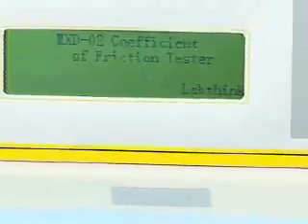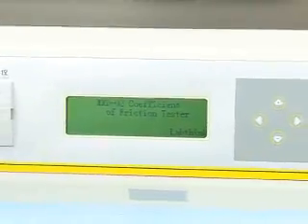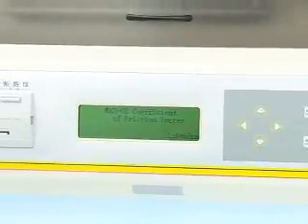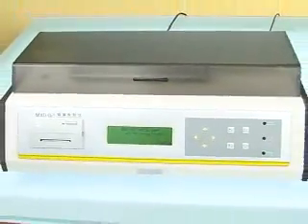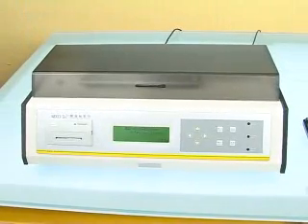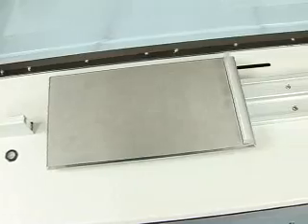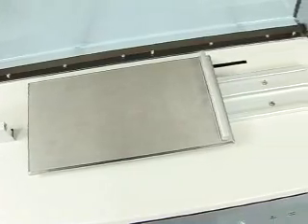Controlled by microcomputer, all operations can be done with the keyboard. An LCD displays data, results, and curves. Material state is estimated and test results are analyzed using quantitative discrete methods automatically.